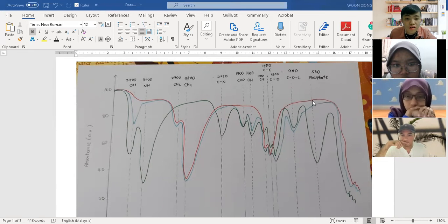Actually, for the overall process, the lipid nanoparticles, the blue color line, will protonate, which is the ester bond, including C=O, C-O-C, and also some OH bonds.